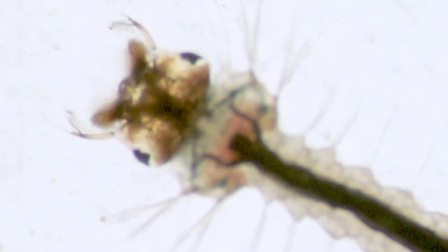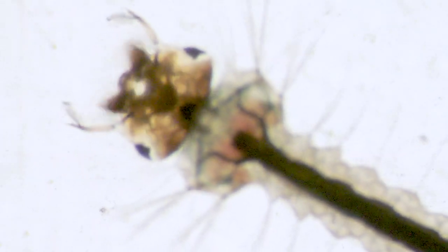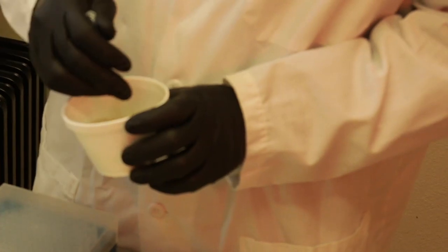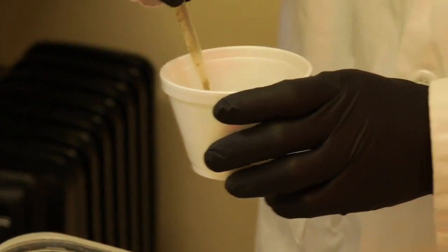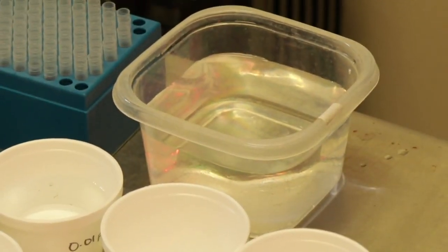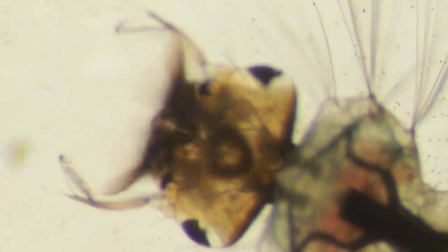Larvae will need to be fed for long-term bioassays, such as required to test insect growth regulators. Investigators differ whether or not to feed mosquito larvae during short-term bioassays of 24 hours. For bacterial larvicides that must be ingested by larvae, the food levels and organic matter in the environment can influence the outcome of bioassays.